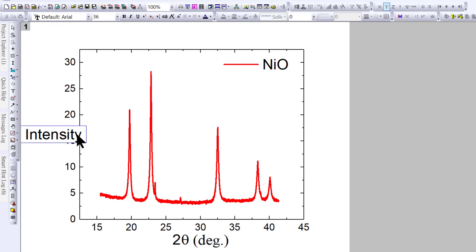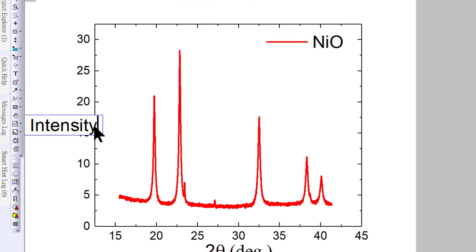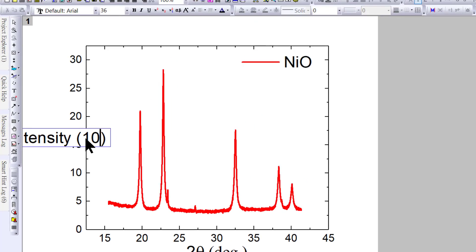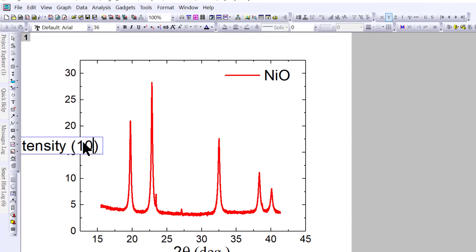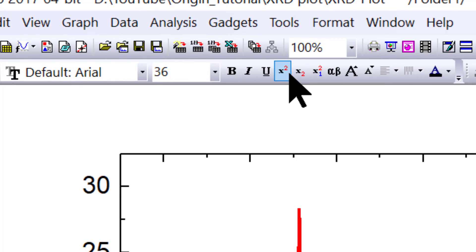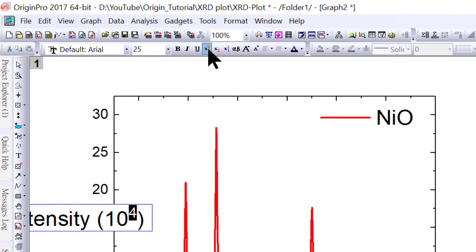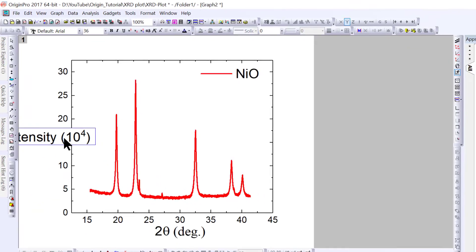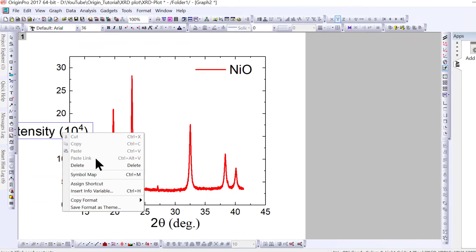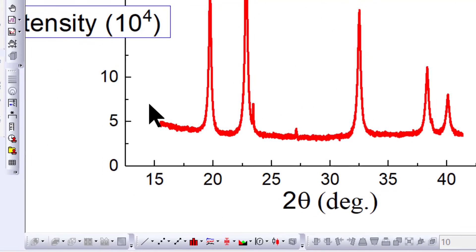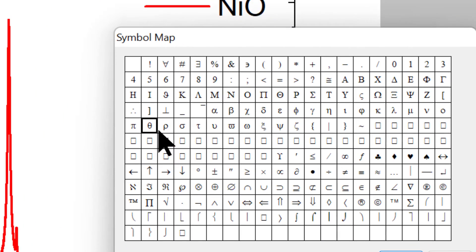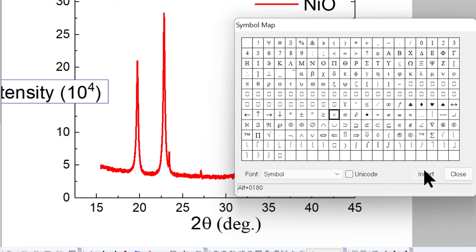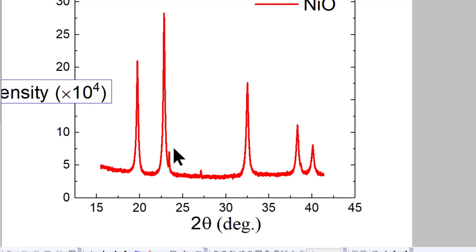In the intensity label, you can write in brackets 10 to the power 4. Select the number 4 and use superscript. For the multiplication symbol, right-click, go to symbol map, find the cross symbol, and insert.